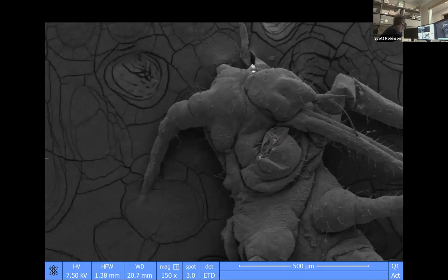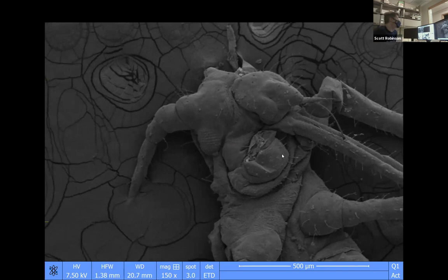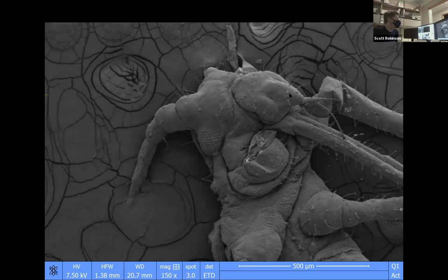That's right. So one thing about this could be a gnat because this is a flying aphid, and it looks like a mess. And what happens with aphids, we don't get them really often, but if we do get them, we need to be able to dry them so that they won't shrink. And so the way that we do that is called critical point drying. And we'll take them, and they may be fresh, maybe somebody froze them or something like that to kill them.